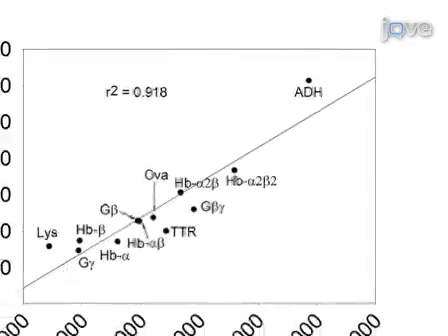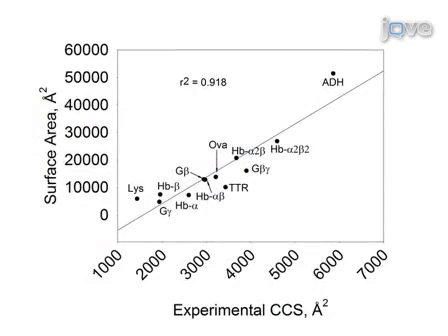When repeating the same calculation on the resolved crystal structure of hemoglobin, the ratio of surface areas of tetrameric to dimeric forms was 1.63, which fits a D2 symmetry. Obviously, this geometric model is simplified, and protein subunits are not merely spherical. However, this calculation demonstrates the exciting potential IMMS holds for revealing the packing of complexes with unknown high-resolution structures.